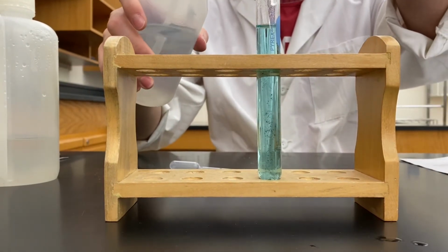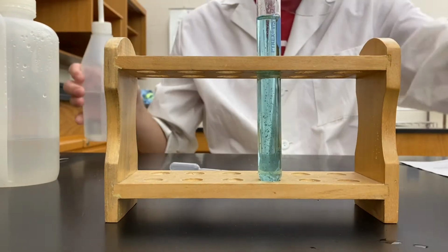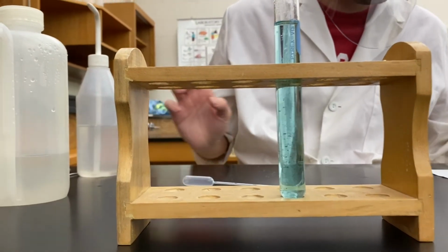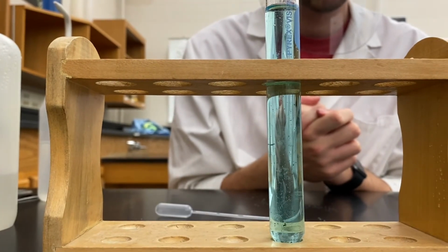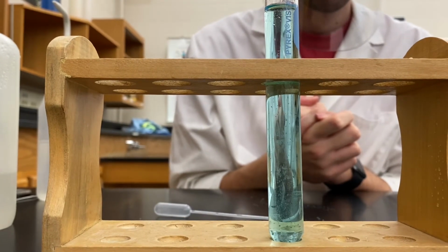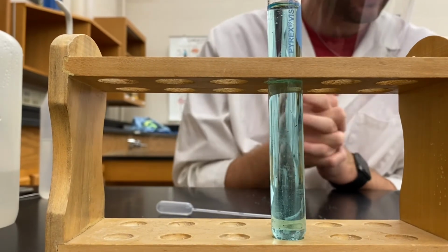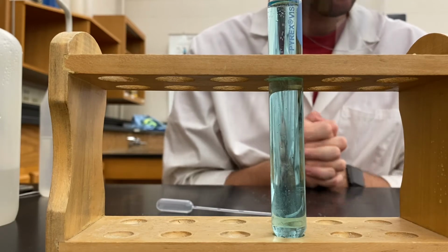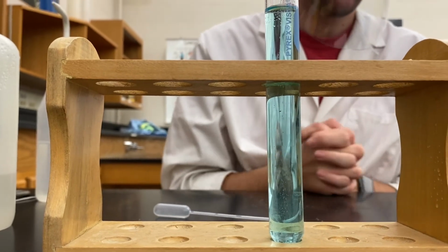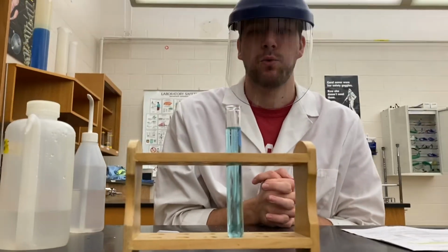I'll rinse it with some distilled water again. So again, you can see our reaction still is happening a little bit. And again, the products of this reaction are copper 2 chloride and water.